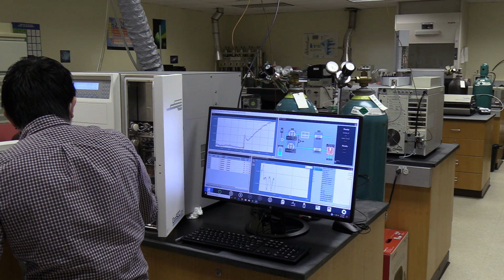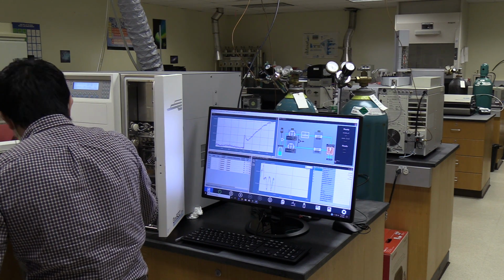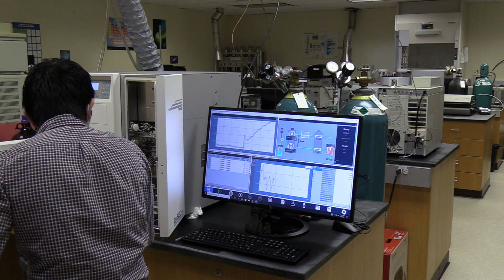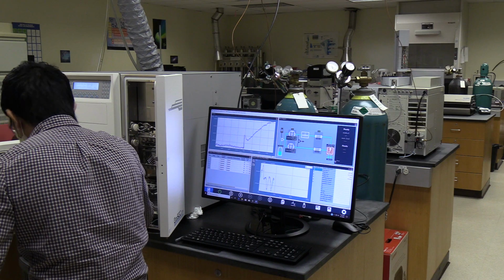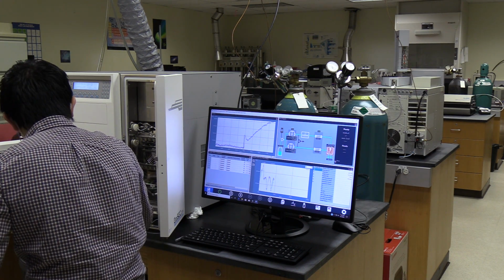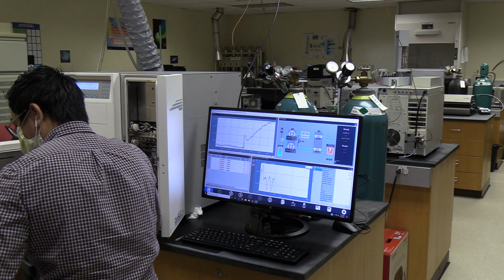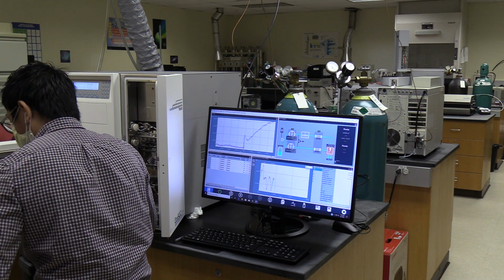What's going to happen is that you're going to have 2 lines here. One line is going to be for your sample column, and the other line will be for your reference column. You will know which one is your sample column by locating this line right here. It's going to say S.pull. This is the tubing that goes into your sample column. This S.pull will go into your sample column, exit your column, and then go into a line called RI.S. And RI.S will be your sample tubing that goes into your RI detector.